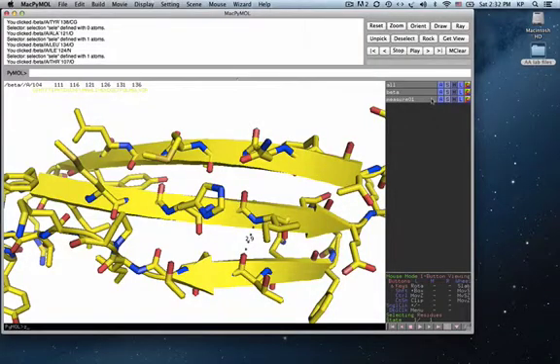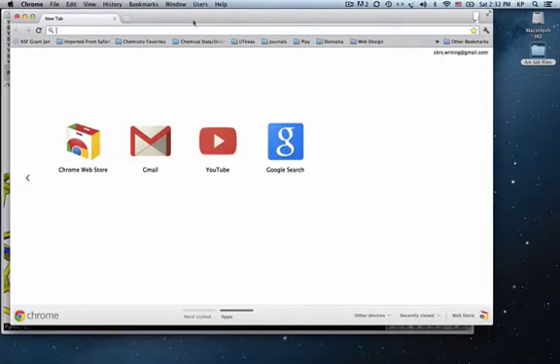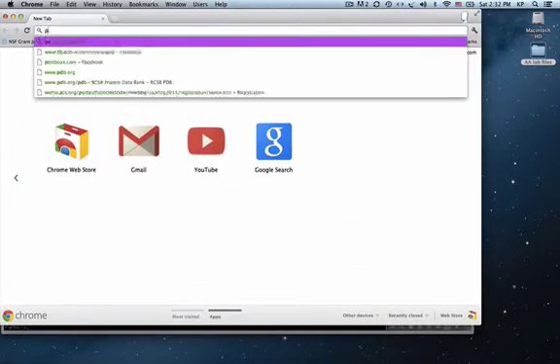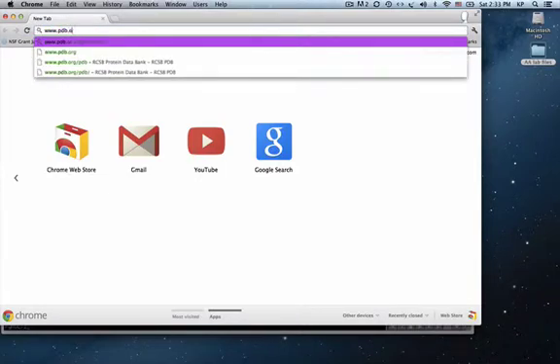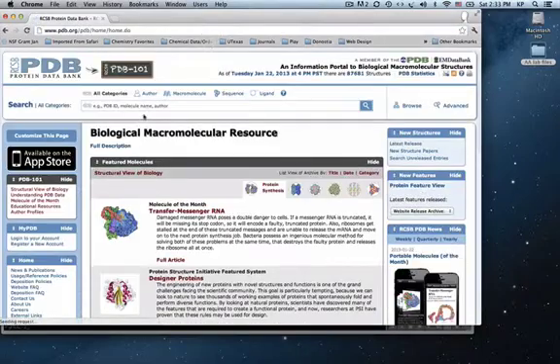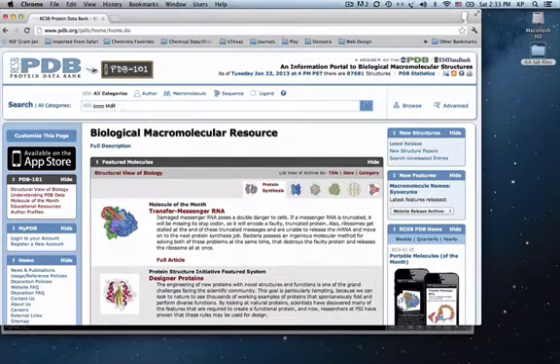Now we're going to go into a little bit more of an advanced consideration. We are going to search the protein database, www.pdb.org. Here I know the author of a paper that I'm looking for. This is the final part of your tutorial. And so I want to write in Tim, and let's go ahead and just put MUP1 for the mouse urinary protein 1.